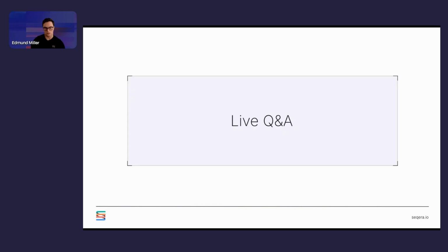Okay, very cool. I got another one from Alex. What does Seqera AI get trained on? Is it just core Nextflow modules, sub-workflows, pipelines, or is there more to it? Is the agent able or good at integrating knowledge from user inputs and from the lab as well?